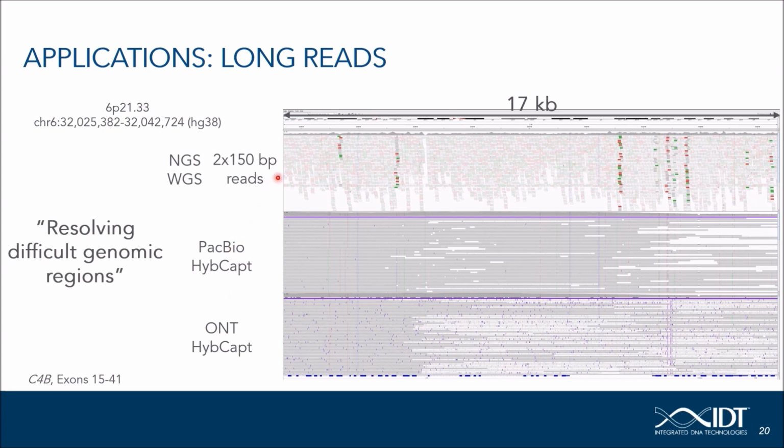The short-read track comes from the Illumina marketing dataset, the so-called Platinum genome, while both long-read datasets were sequenced at our institute. The light color of some reads implies that the mapping quality is 0, indicating that these reads are not uniquely mapped to a particular region, but they may also be mapped to another genomic locus. Only very few of the reads can be mapped uniquely, since in their alignment area there might be some unambiguous sequences present, allowing them to be anchored at these coordinates.